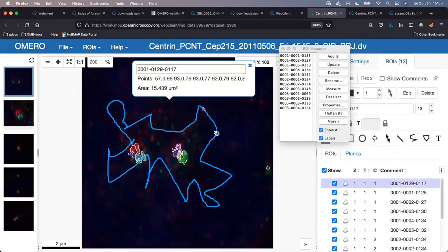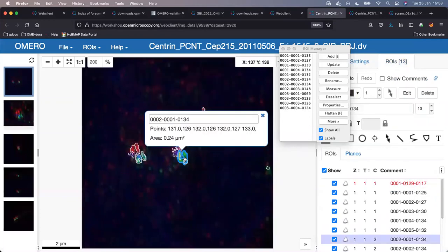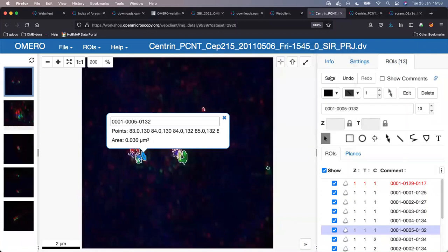see those. And this is a funny ROI which are drawn manually, but these are the ROIs which I just did from the serious segmentation. You can see they make sense. They do make sense. They are really around the objects, around the centrioles. This is real serious segmentation, and they are coming from Fiji. Okay, so remember that for me, because we will come back to that.